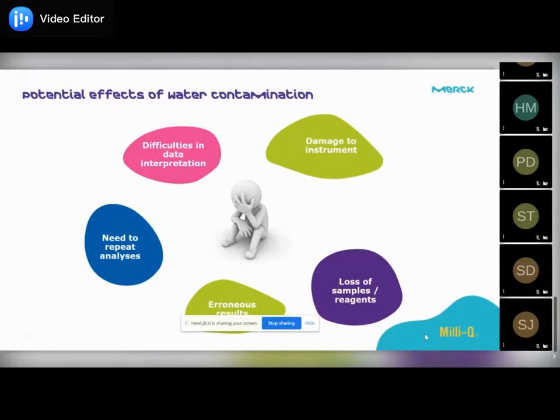One side, you will be losing your valuable time while repeating your work. You will not be getting a good result even if you repeat it, and at the end of the day, probably your professor will question you about what exactly you are doing. You can report to him or her, sir, I keep on repeating the experiment but I am not getting good results. So at the end of the day, from a results perspective, it's not good. This is one. The next thing, it may damage your instrument.